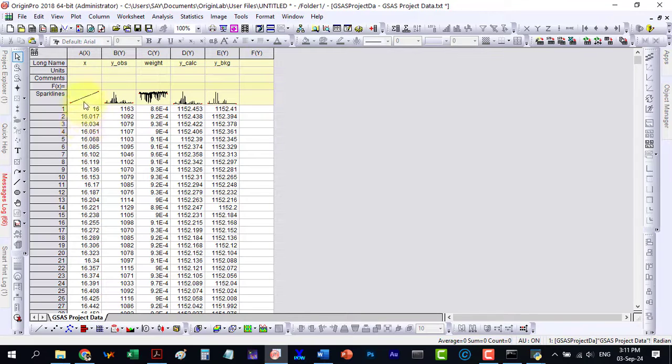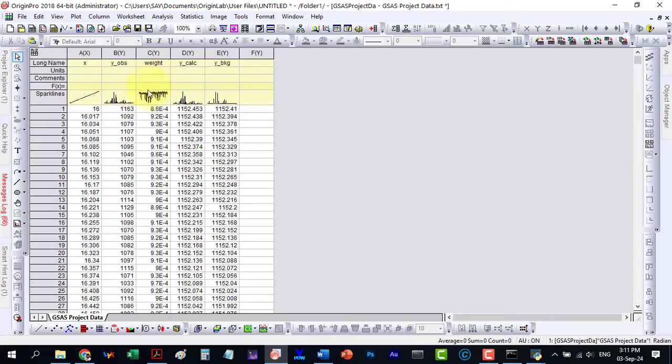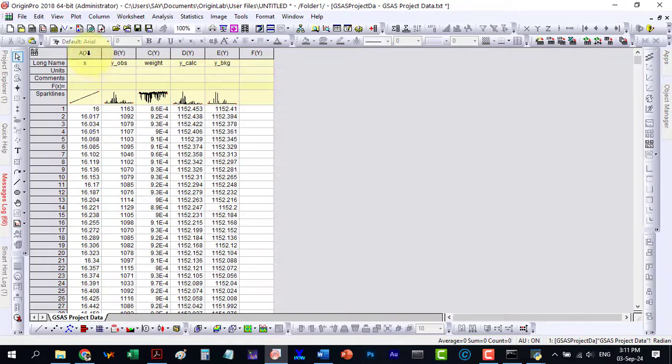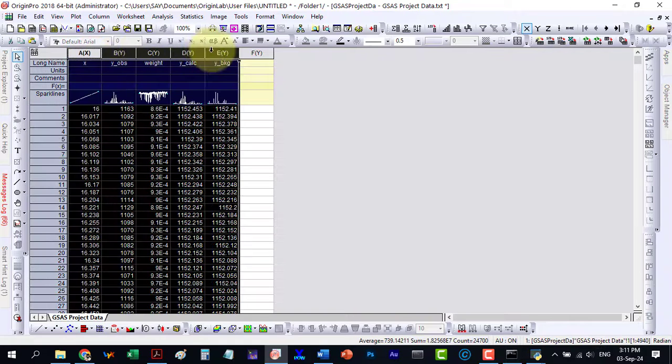Here are all the data columns. Let's plot this data.